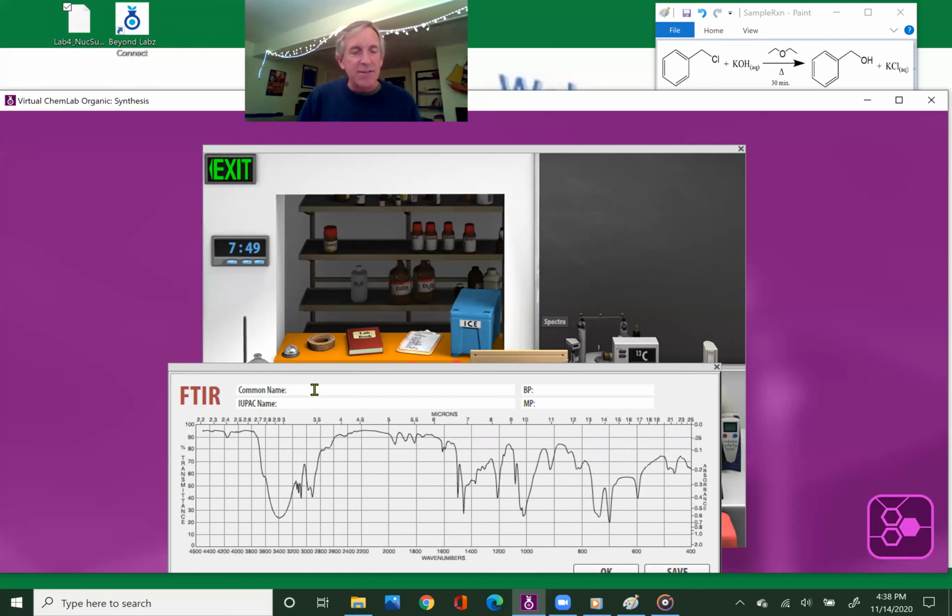This is what would be nice so that when you write product here, oops, sorry, I mistyped, but when you type in product and copy and paste this, you're already confident that you have made your product. And it just takes a little data table filled out to prove it to me in your Google Doc that you share with me. Okay?